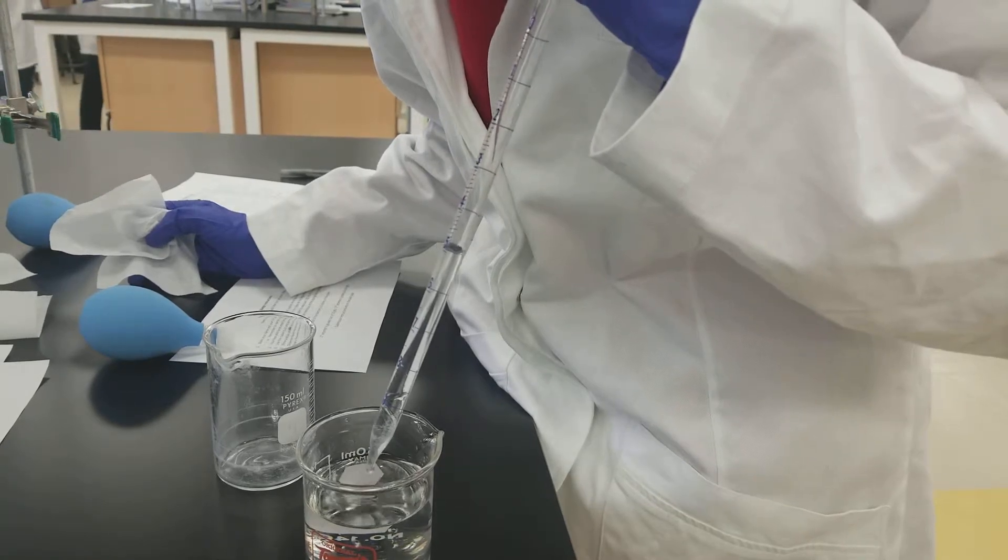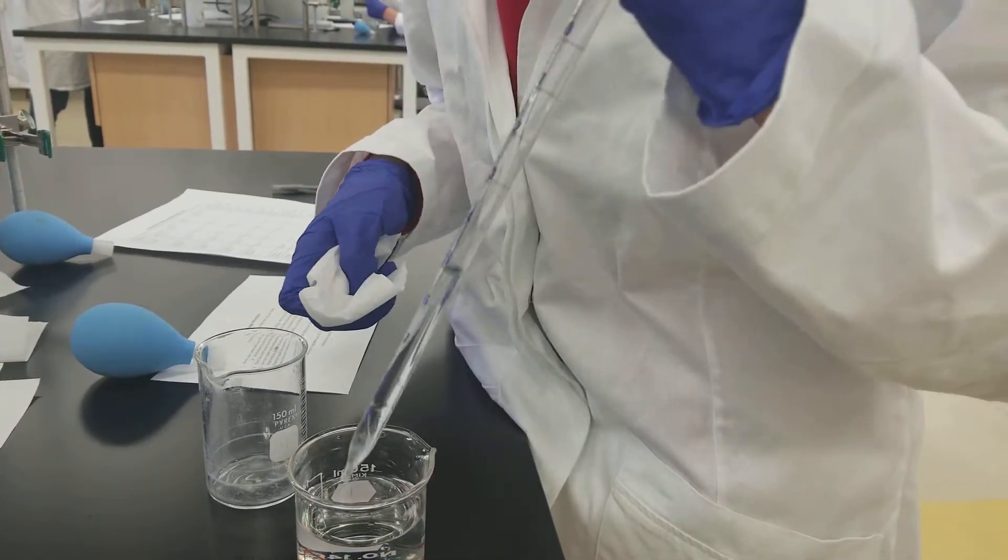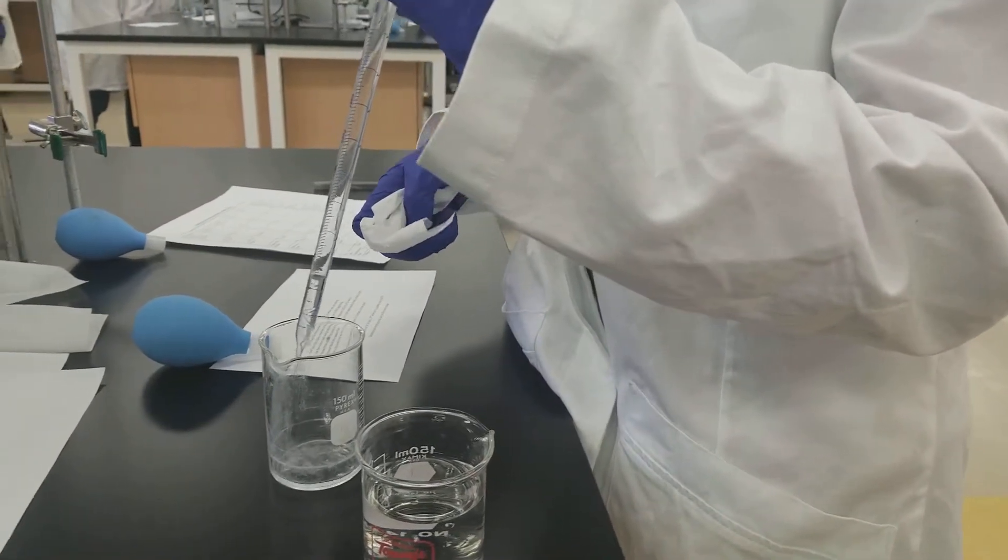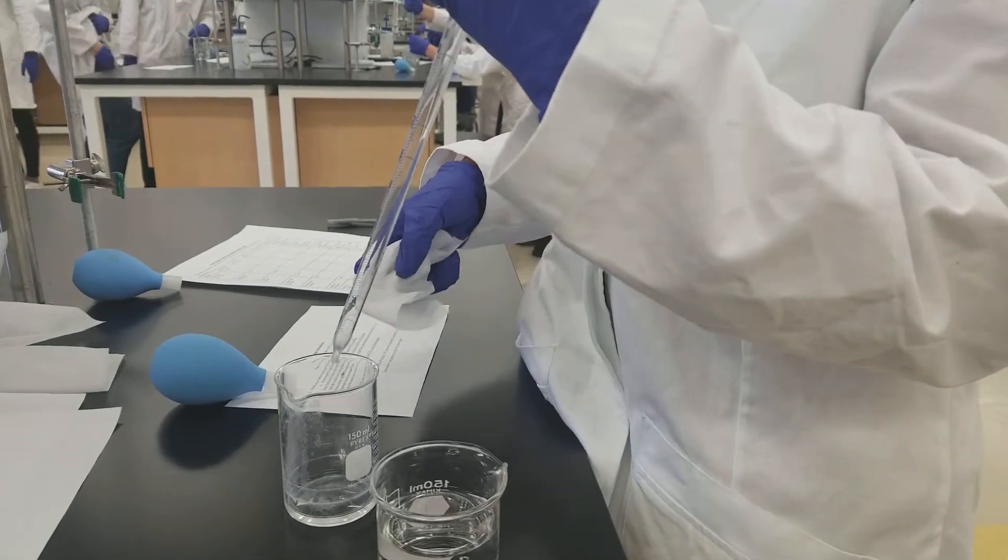Okay, the meniscus is right at the bottom of the 5. Close enough. And so I'm going to wipe it with a Kim wipe. And I'm going to tap it on the edge again. And I'll just put it in here. Okay, I think that's it.